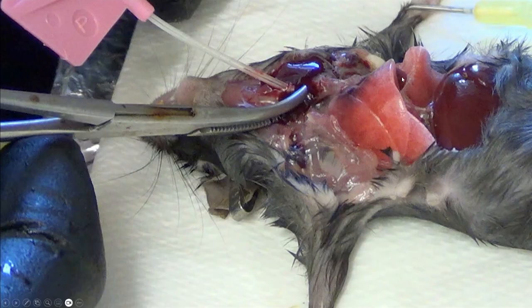You see some more lung on the other side, the left lung, but the agar has been injected, and it is inflating the lung thoroughly, nice firm inflation. This is what you want to see. Nice healthy lung, firm inflation in this way. This is a very nice slide to illustrate what the lung should look like when it's fully inflated.